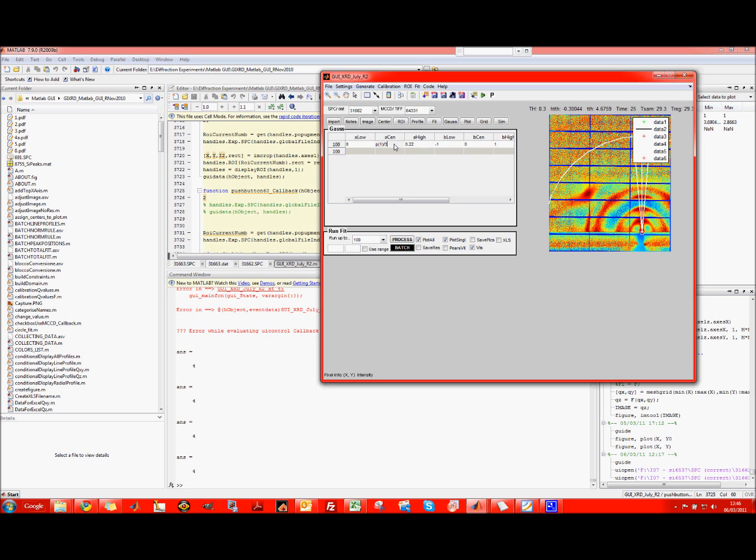So we can use a central point like that, high boundary like that, low boundary for the peak center Q1 times 0.99, and high boundary Q1 times 1.01, and then we can use equal, so that clearly here you have the same value that you have there.